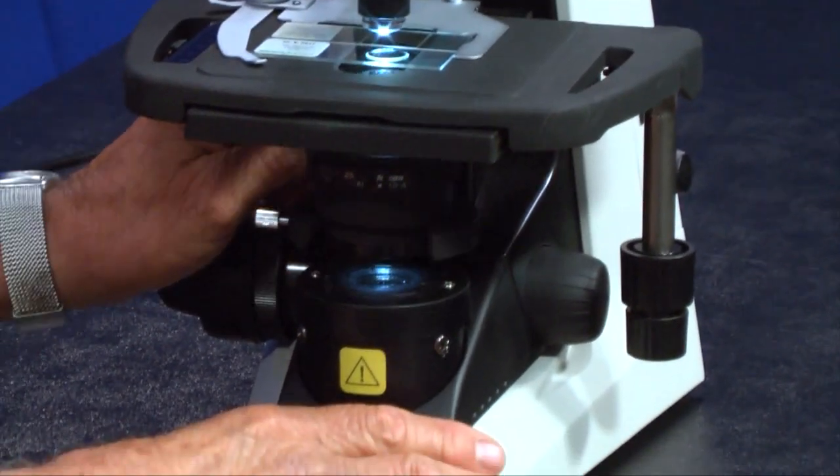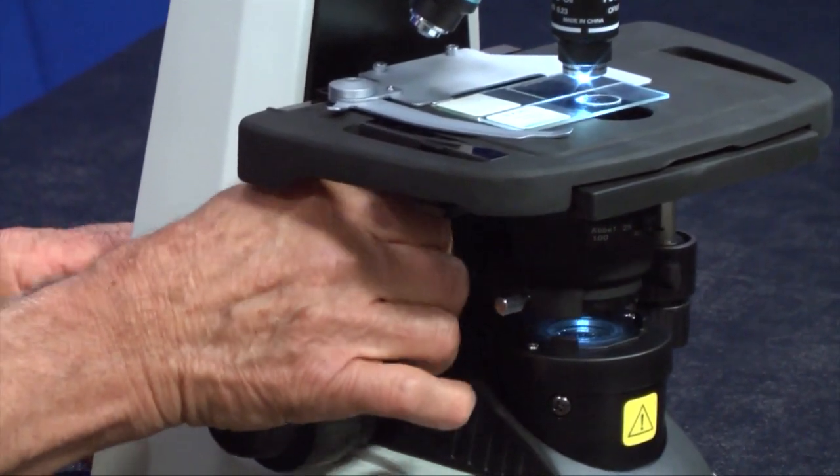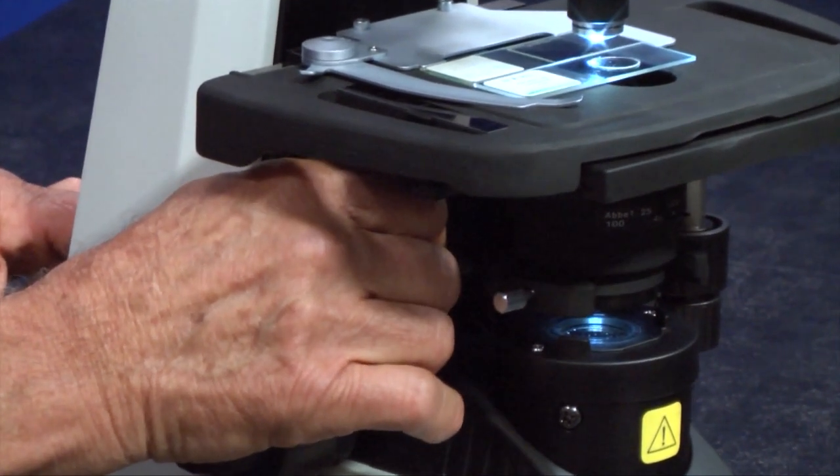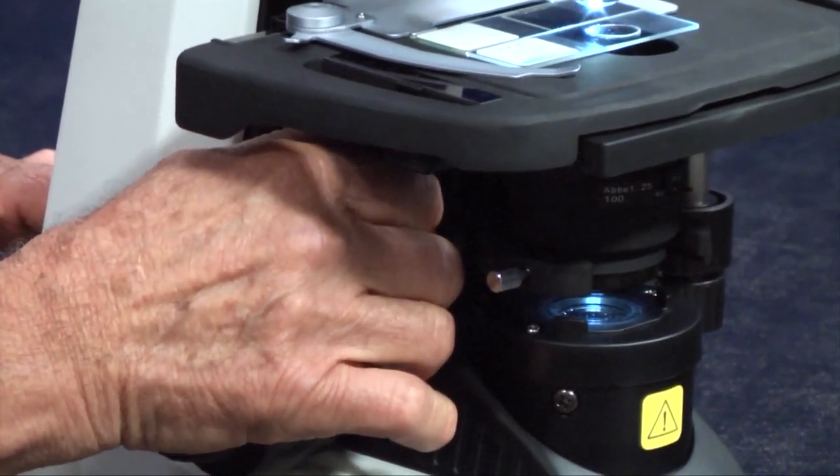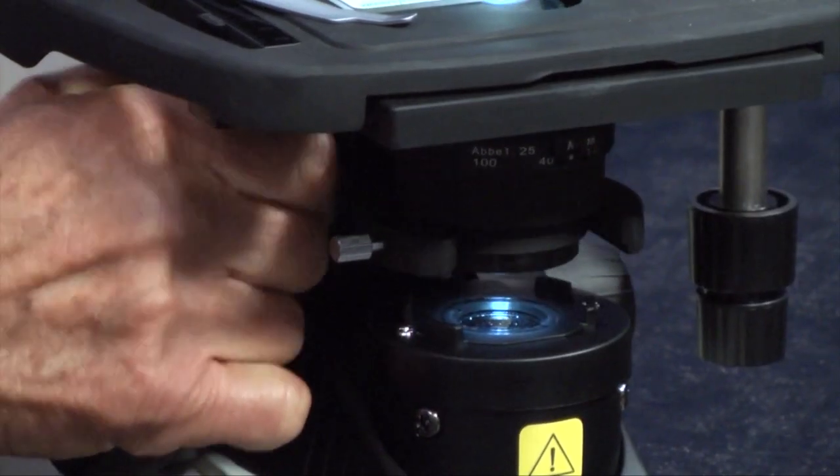You can adjust the height of the condenser with a knob on this side of the microscope. Frequently people do drop the condenser down, especially when they have a very low contrast specimen. That's why it's on a rack and pinion that allows it to go up and down like so.